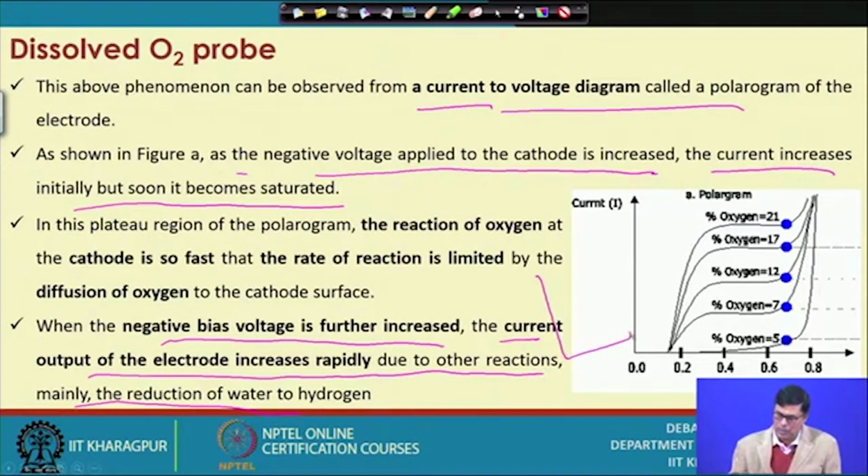Now, one thing I want to tell here is how we calibrate this dissolved oxygen probe. First, in the fermenter, suppose this is the DO probe, we sparge nitrogen just to drive all the oxygen out, and when the monitor shows that the result is constant, we adjust it to 0. Then this is replaced by air, and you will find the dissolved oxygen concentration increases, and when the number is constant, we fix it as 100.